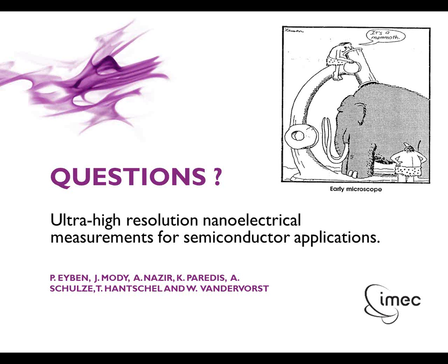The first point is that typically when we see this peak, we can see an increase of the resistance peak over an oxide thickness of 0.3 to 0.5, which means the resolution is 2 times that. As you can see in the slide, the resolution is 0.6 to 1. Yes, it is tip dependent. It is also a bit voltage dependent, and it is mainly force dependent. These kinds of resolution you can reach only if you use small voltages, 50, 100 millivolts.